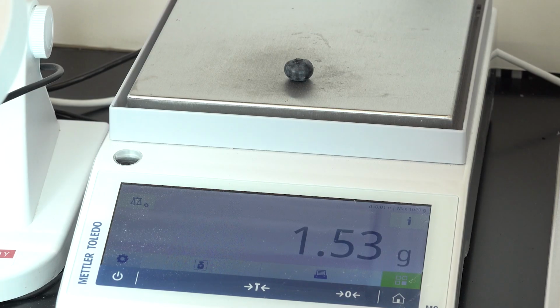Compared to FirmTech, the biggest advantage of using an instrument like the texture analyzer is that you can collect multiple texture components of a berry. The texture of a blueberry is a very complex trait which cannot be understood by one texture component. So being able to collect multiple parameters using a texture analyzer can help us understand the texture in depth.